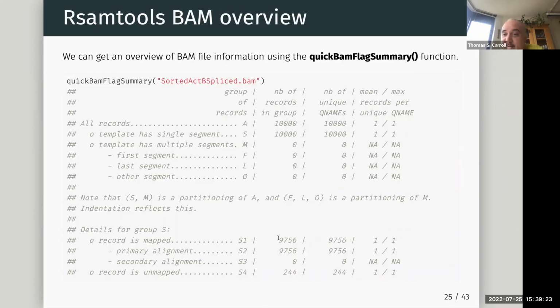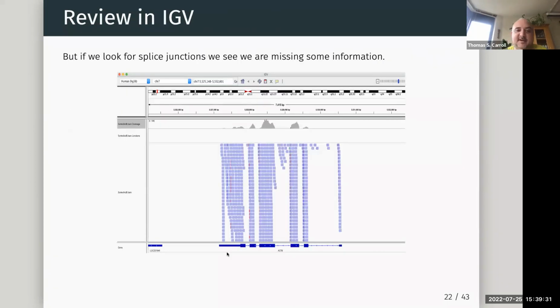Okay. So an interesting point here is that the reason we didn't get a lot more reads mapping is because subread has already mapped them in this strategy. And it didn't map them by mapping them across exons. It actually did it by clipping the ends of reads. So it said, this read maps best to this region apart from the end of the read. If I remove the end of the read, does it map better anywhere else, or is this still the best region? And that would be the post-index alignment step.